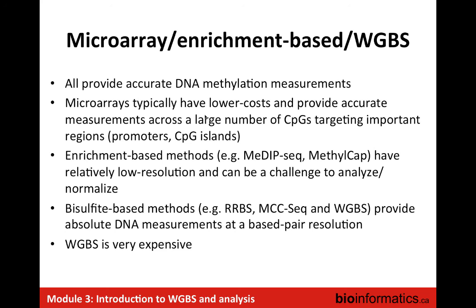When you mention that WGBS is very expensive, is it because you are looking at the whole genome? Can you pool your sample, or is it one sample? So, you can pool samples, but typically that's not going to help, because to be sensitive enough to detect the methylation level, every base that you want to estimate needs to have coverage on it. So it depends what resolution you want.